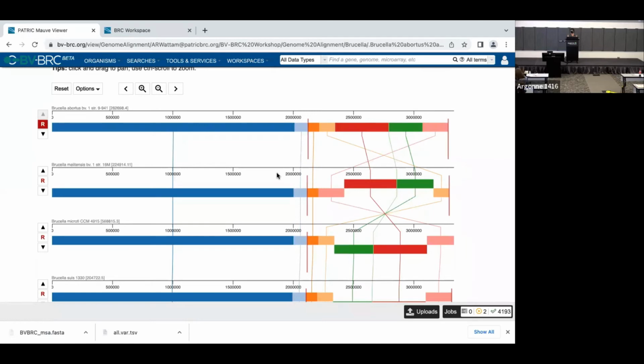The one thing that I really dislike about our version of this tool is it does not give you a download SVG function, which I think is a big failure. And I think we put in a ticket for it. So I've actually had people who want to use it in a publication. And with great shame, I told them, well, you'll have to take a screenshot and submit it that way. But both you and I know that that's not going to pass the quality that they require for publications.